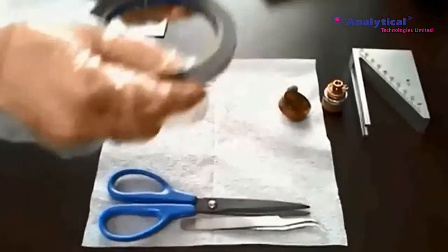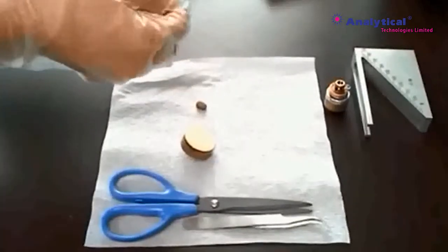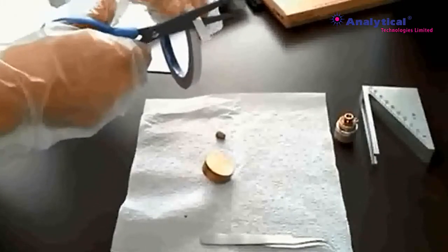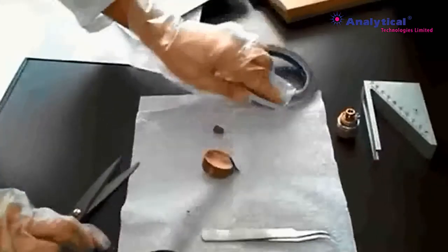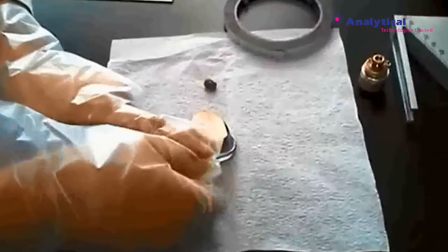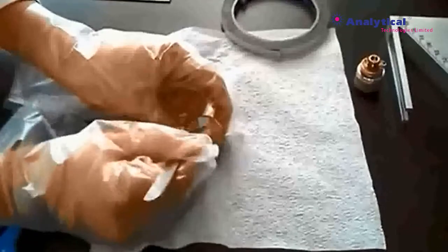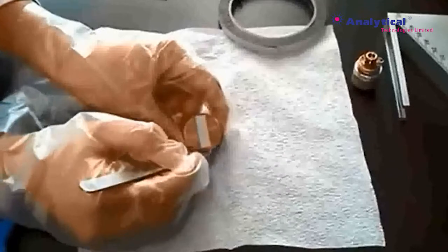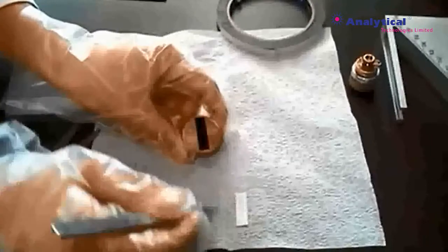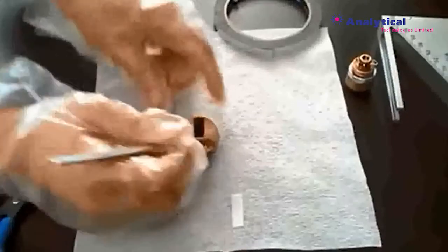The most important part before using the electron microscope is the preparation of the sample. First, cut the carbon tape and attach it to the stub. Carbon tape firmly secures the sample and increases the conductivity. Then, fix the sample you want to observe on top of the carbon tape. If the sample isn't tightly secured, sample will move when you observe.